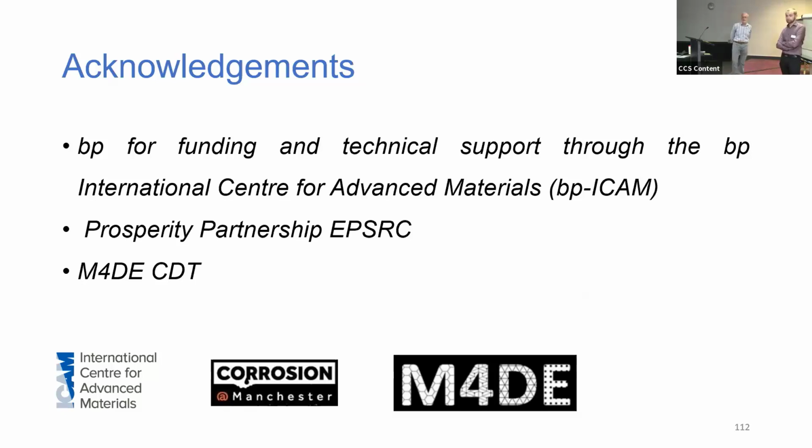All the images that you showed are topographic, yes, the topography of the... Yes, they are. But with AFM, you can also obtain potential maps using scanning Kelvin probe atomic force microscopy. Have you thought about using this technique? This is quite interesting for corrosion studies because it allows you to obtain maps where you will be able to identify the anodic and cathodic sites.